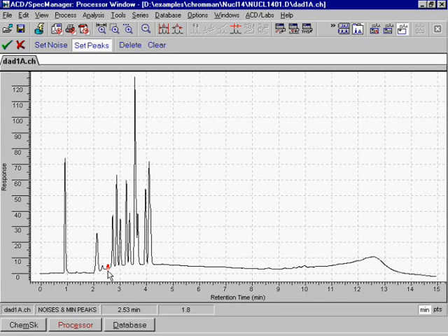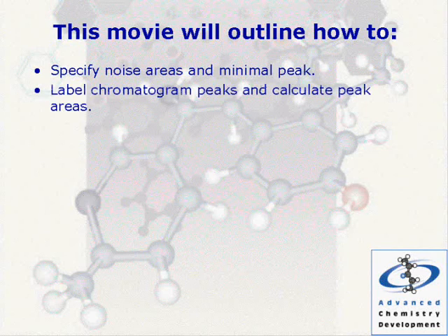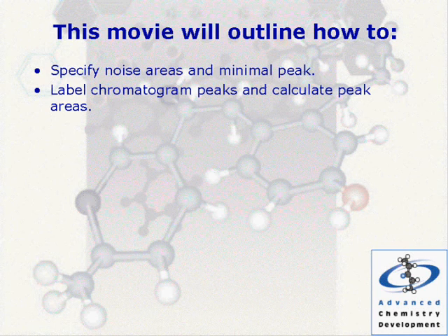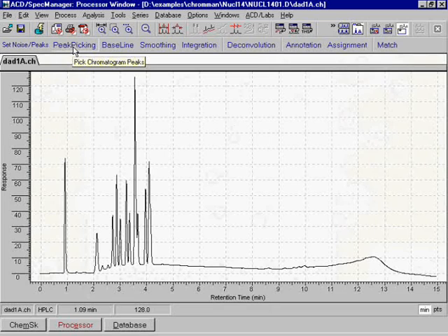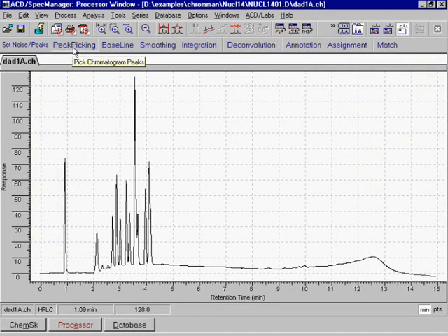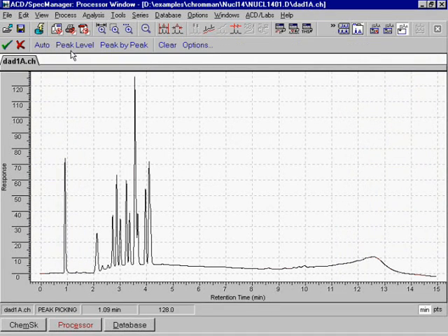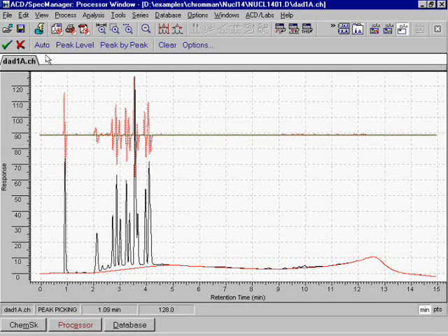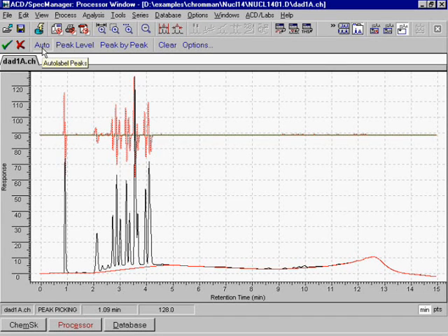Label chromatogram peaks and calculate peak areas. We label peaks and calculate peak areas automatically according to the previously set noise areas and minimal peak.